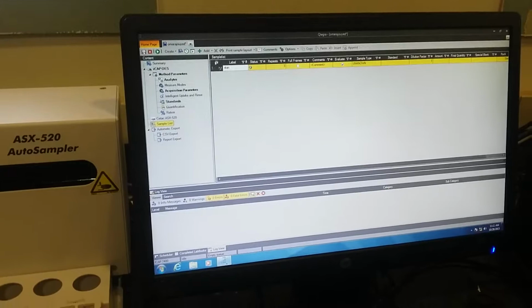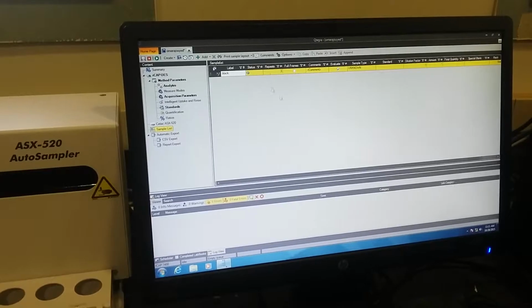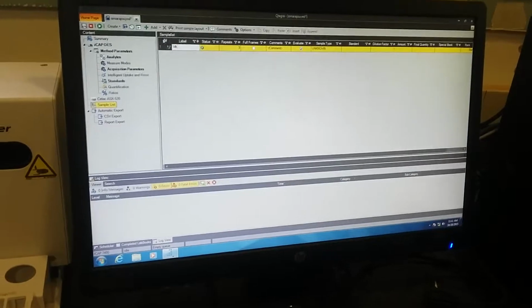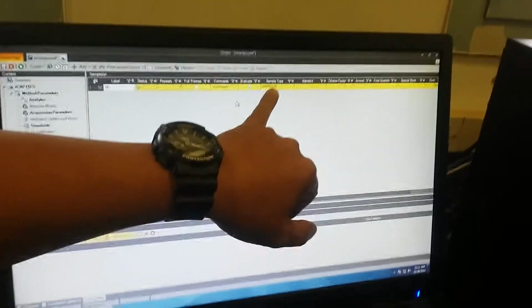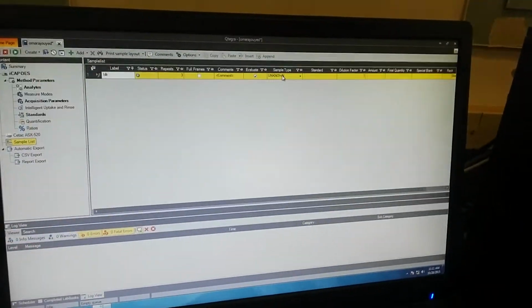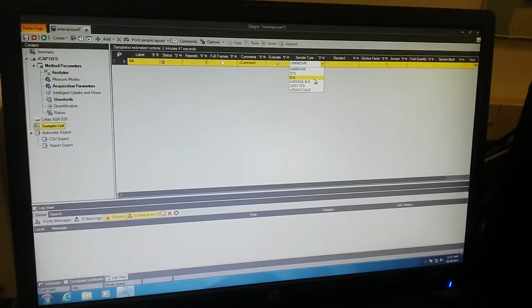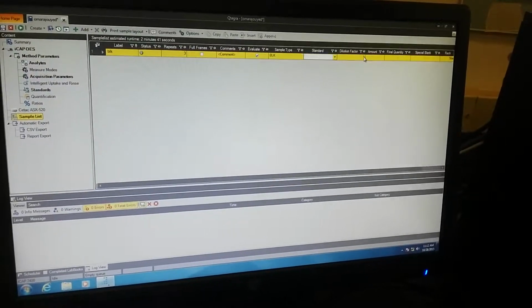We should start with blank. Blank should be BLK. Make it abbreviations, okay? BLK. And then repeats, go here, sample type. Repeats means it will try 3 times, and then he will get an average. Replicate. So go to list, blank. Then dilution factor, nothing.